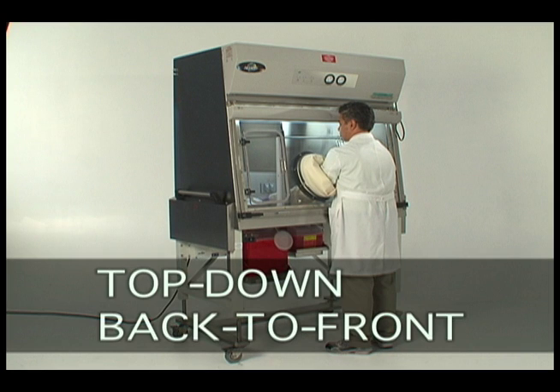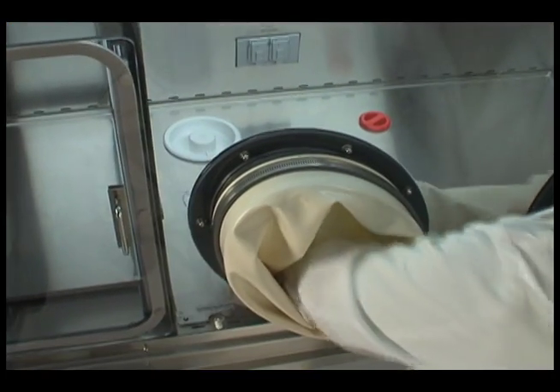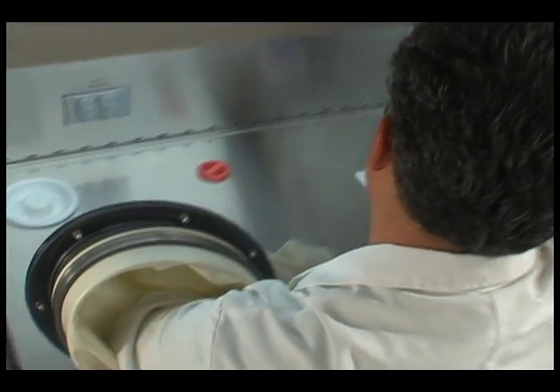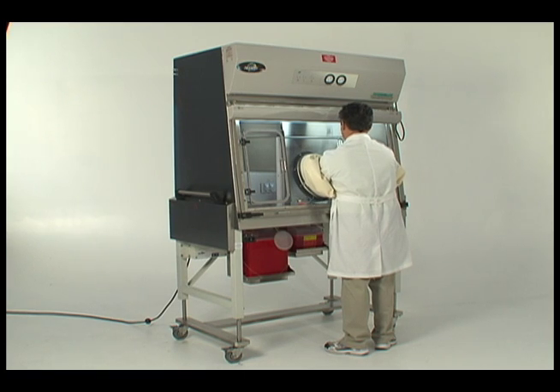Always remember to wipe in a top-down, back-to-front motion, utilizing overlapping strokes to ensure no particulate matter is returned to a clean surface. For best results, fold the wiper into quarters using a different quarter for each stroke. Use a new portion of the wiper each stroke to ensure that contaminants retained on the cloth are not deposited on other surfaces in the isolator.